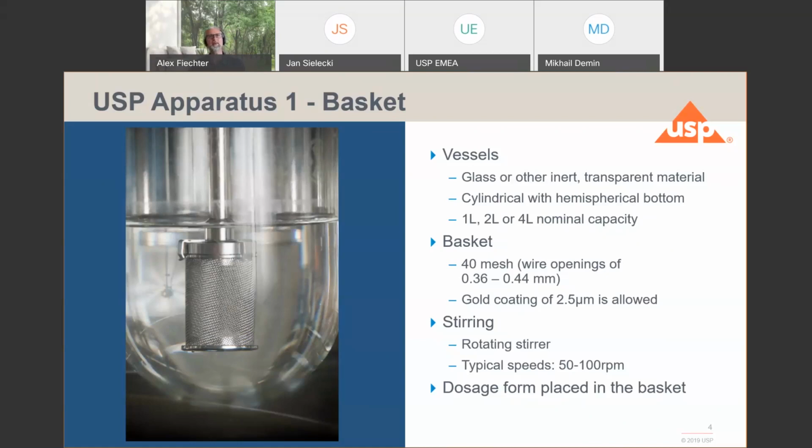The basket that is used here comprises a 40 mesh wire opening that can be gold coated. Again, it is stainless steel, electrolytically polished. So from that point of view, your drug product should not go into a chemical reaction with the material that it is exposed to.